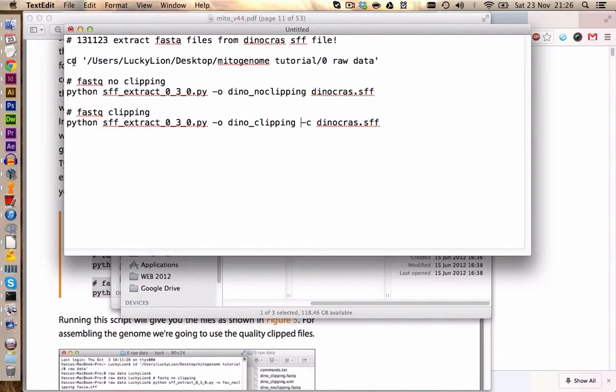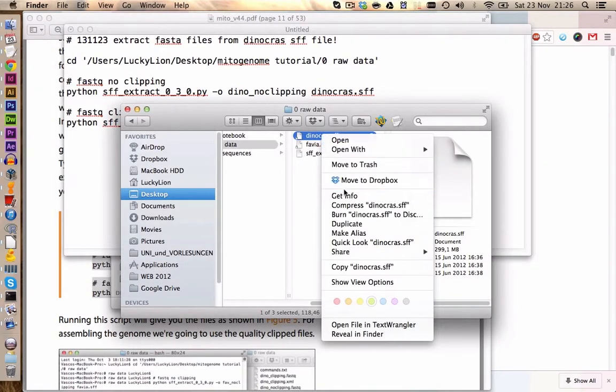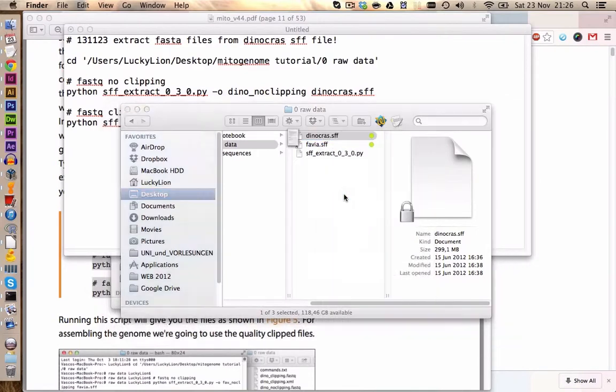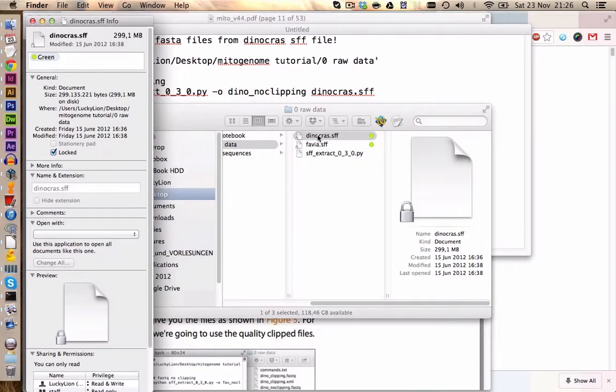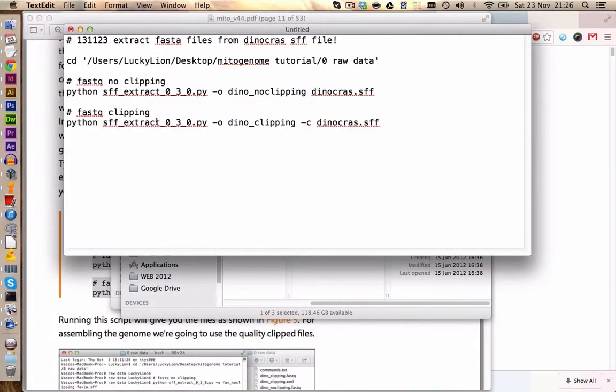The clipping is activated by adding a minus C. Of course we need to have the right working directory. This is already correct, but if you want to set it up on your computer you can right click on the file, get info and copy the location of your files directly from here.